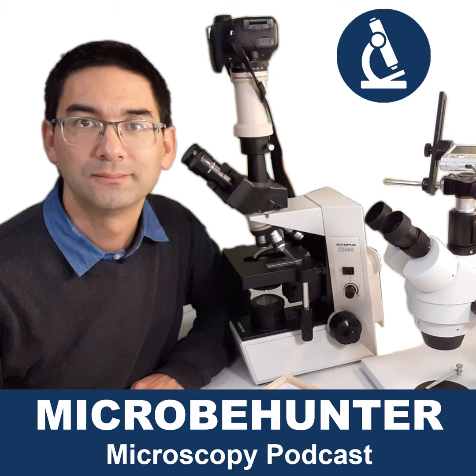So this is the thing I'm concerned about in the process here. Even though I'm pretty much into microscopy, microscopy doesn't solve everything. Especially the whole issue of self-diagnosis: on my web forum and in the comment section of my YouTube channel, there are so many people who are ill or have a medical issue, and they want to know what it is, and they have a microscope, or they want to get a microscope to check it.